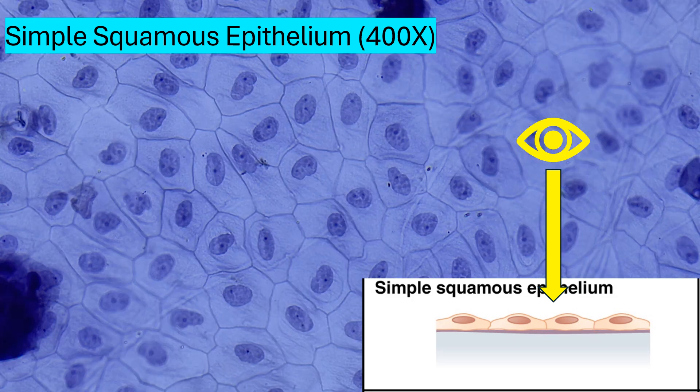Now magnifying to 400 power, you can see much more detail. This is a single layer of cells — that's the thickness of the entire sample — and this is a superior view. The lighter staining regions are the cytoplasm, whereas the darker staining regions are the nucleus. You can even see little dots inside — those would be the nucleolus, the condensed regions. With microscopy it's difficult to identify individual organelles; that's where electron microscopy excels. This is a unique view, the top down view — let's look at a more three-dimensional sample next.